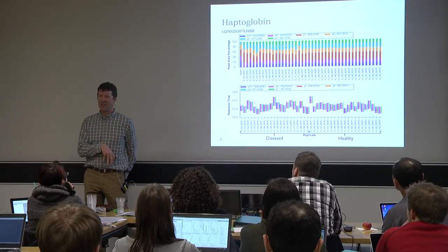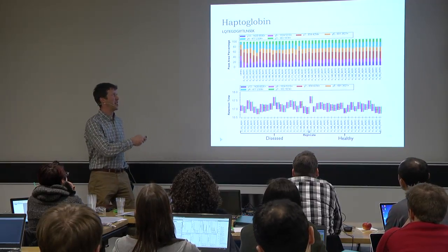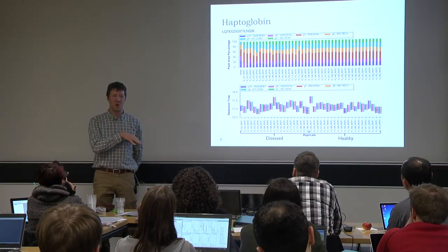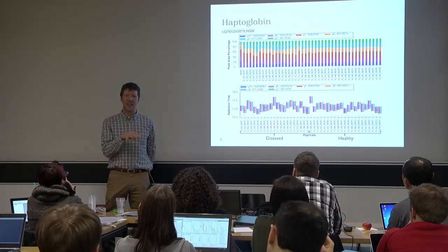And so this is a thing, when you look at a lot of these plots, you're going to start to see it. In the next slide I'm going to denormalize this. Can anybody guess what's going to happen?